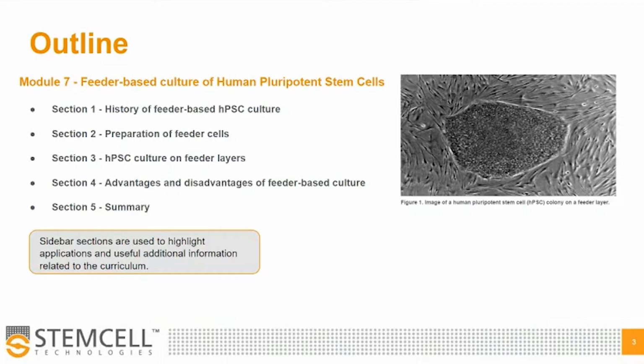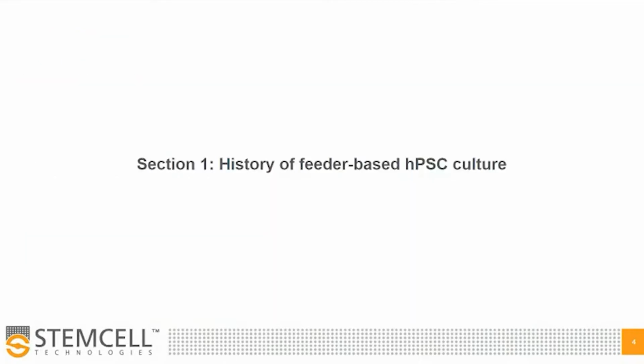Figure 1 here shows an image of a human pluripotent stem cell colony on a feeder layer. Section 1, the history of feeder-based HPSC culture.